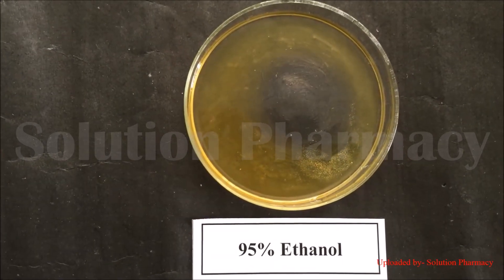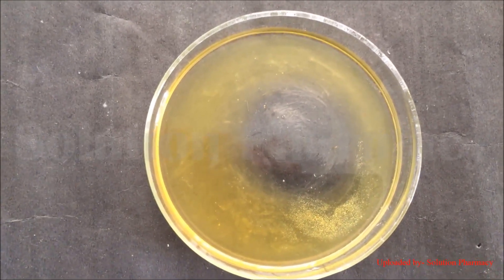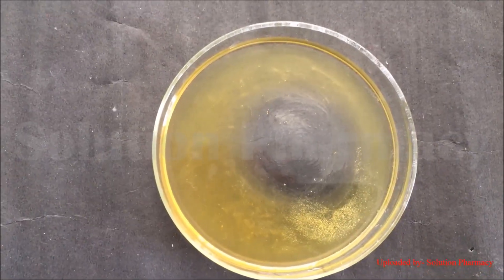DNA is insoluble in ethanol and isopropanol. On addition of ethanol, a white precipitate of DNA comes out of the solution. Within a few minutes, you can see small granule-like structures which are nothing but DNA beginning to precipitate after addition into the ethanol.